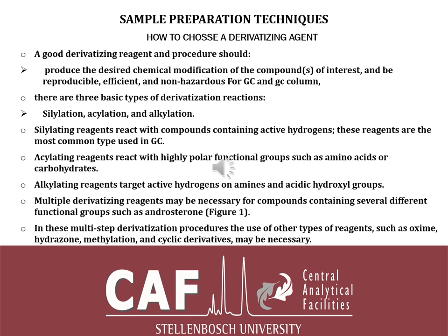Before doing derivatization, it is important to understand and know what you need before choosing a derivatizing agent. A good derivatizing agent and process should produce the desired chemical modification of the compound of interest, and be reproducible, efficient, and non-hazardous for the GC and the GC column.